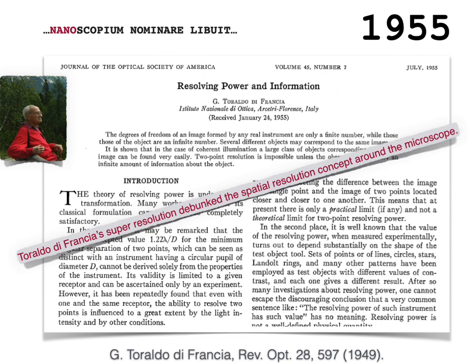Simply add information about the image formation process and use this information plus the diffraction limited information coming from the lens to form your final image. Today, you can do this very well. You have powerful computers to perform this kind of link between the information you know about the sample, about the way you're interrogating the sample, the diffraction limited system, and the final image formed on your digital screen.